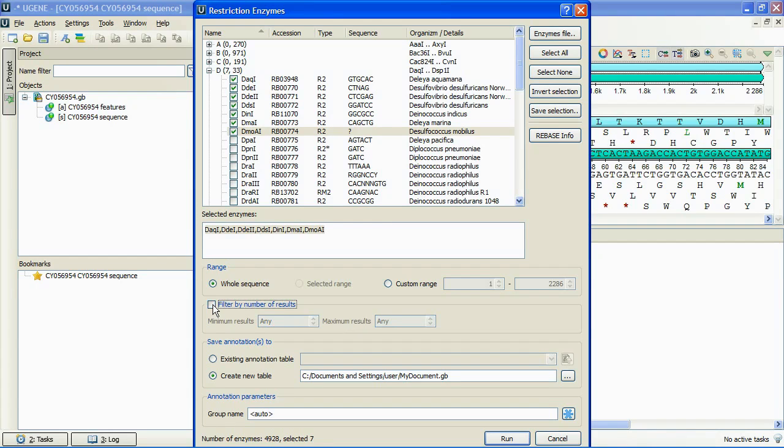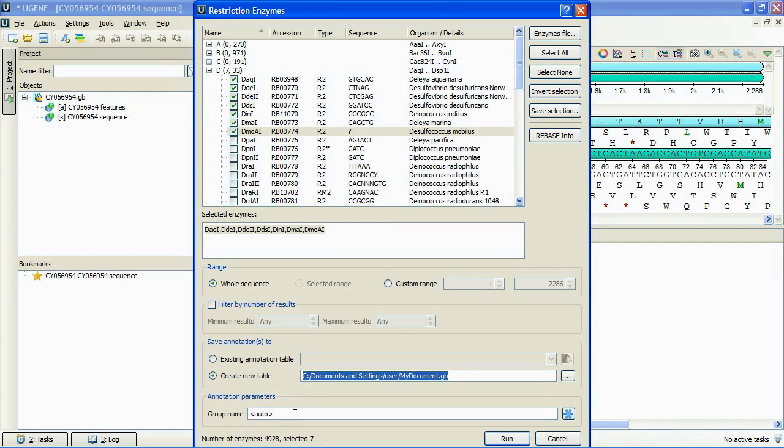Finally, we need to specify an annotation table to save the results into. We will save the results into a new file and enter Enzymes name for the results group. Click Run.